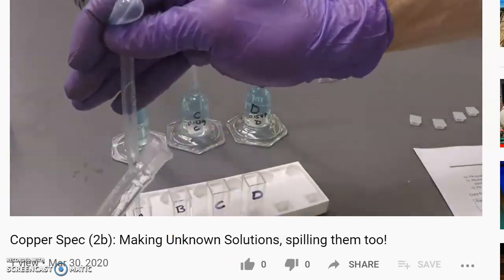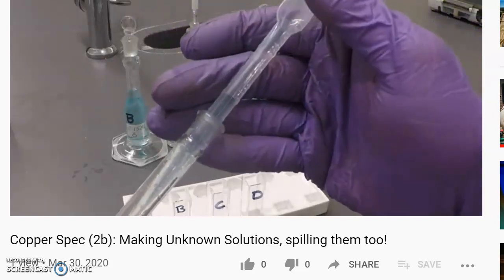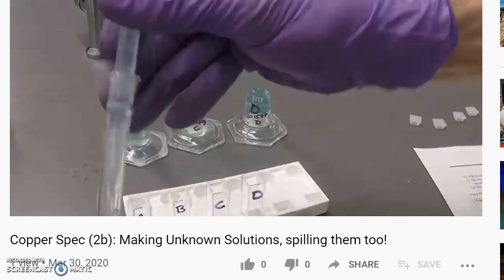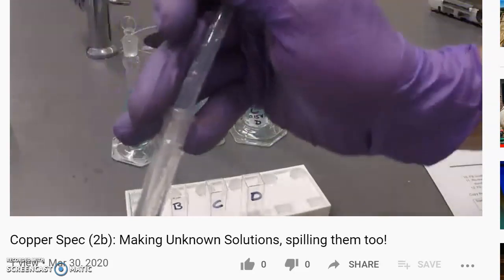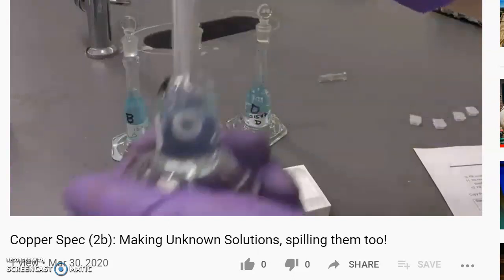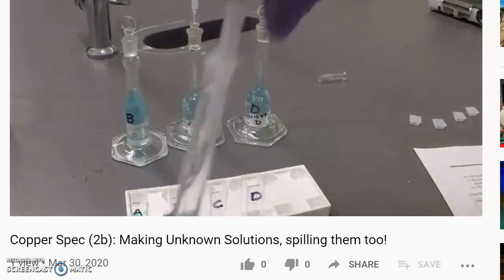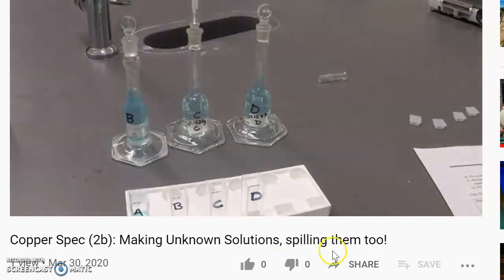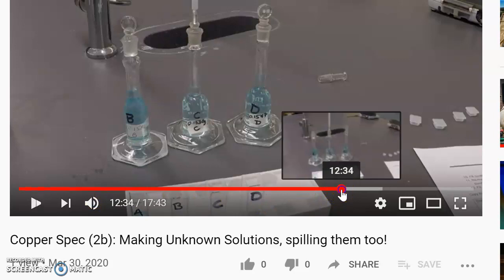We're going to fill our cuvettes and then read them. So we're putting A into the cuvettes. And then we're going to read them. And I'll show you that.